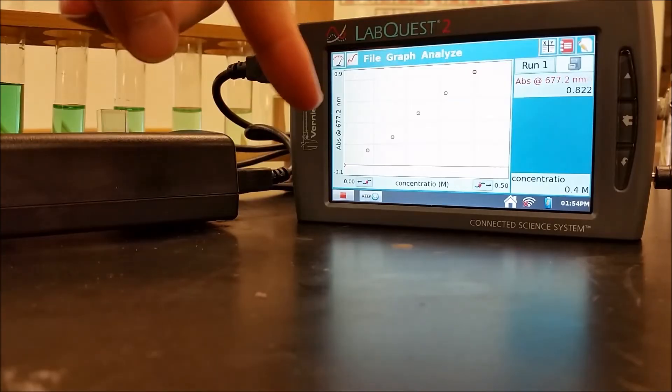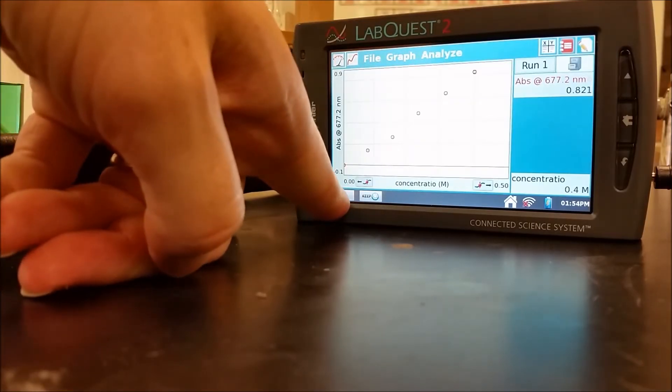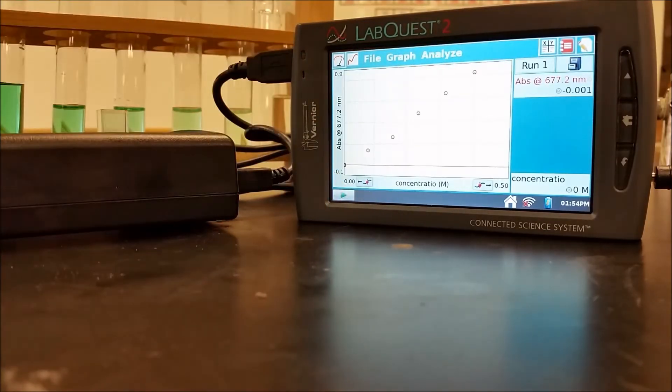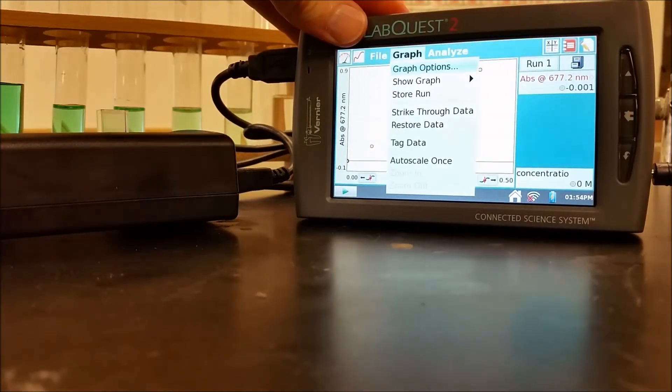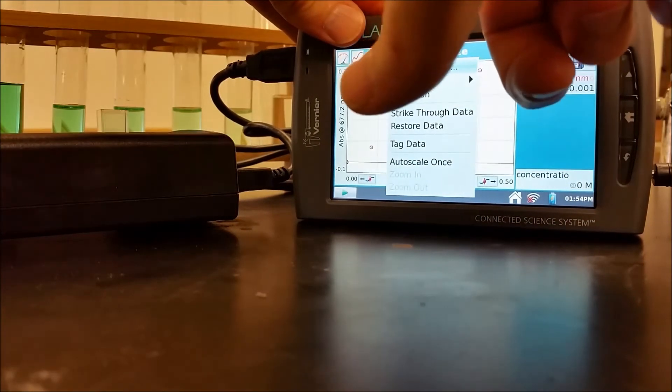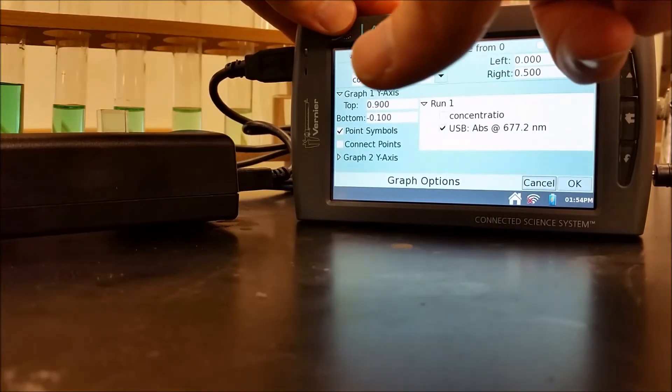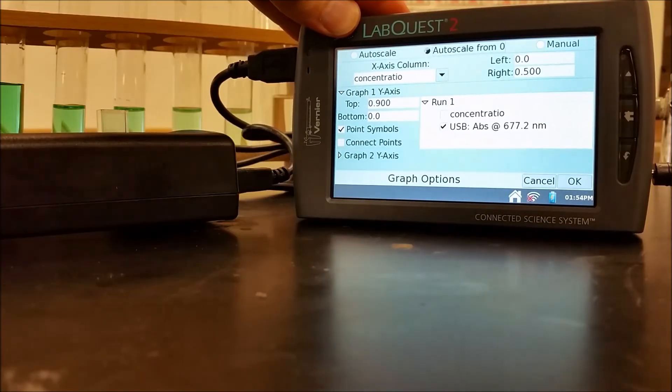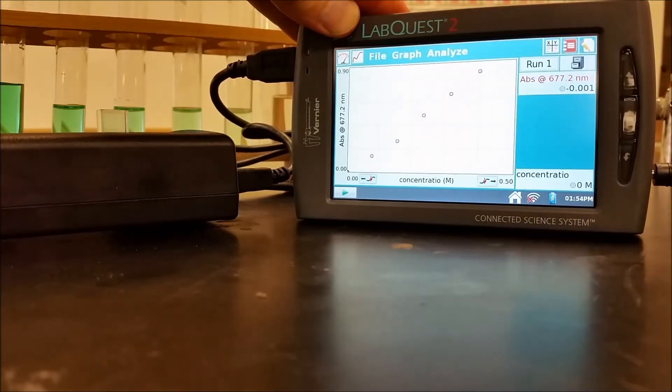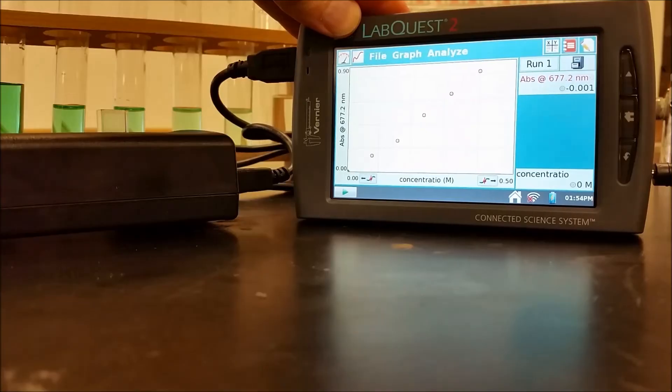So now you can see that we have this linear result. So what I'm going to do now is hit stop. And I'm going to show you how to analyze this. So for graph, you want to hit graph. And then under graph options, you want to hit auto scale from zero. That's going to put you through the zero, zero intercept origin. Then you want to go to analyze.